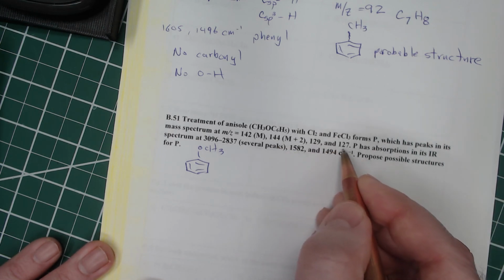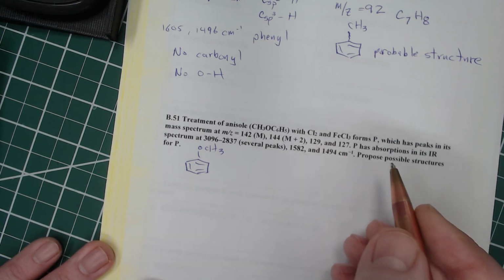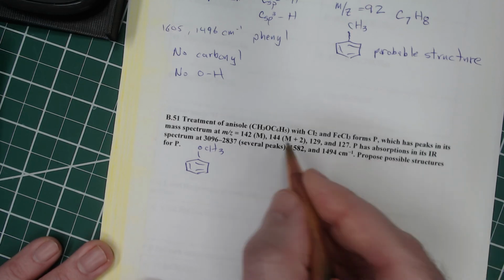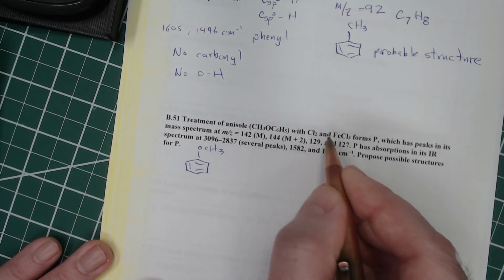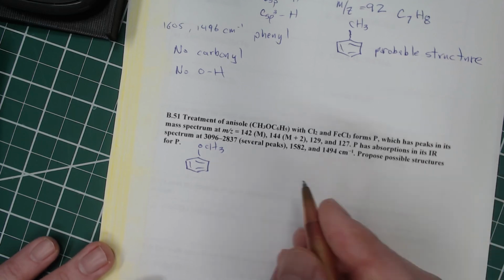And then 129 and 127. We're going to assume that the 142 and 144 are our molecular ion. And because we get that double peak, now it doesn't indicate that it's a 3-to-1 ratio, but we've got chlorine here. It looks like we put a chlorine on the molecule.